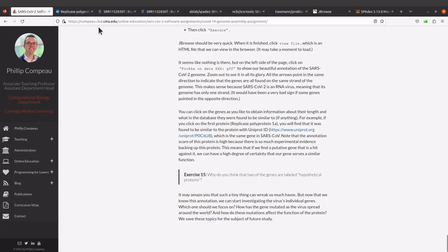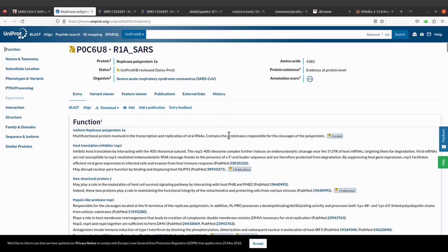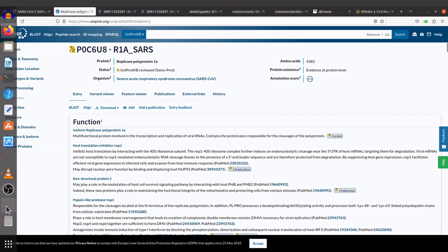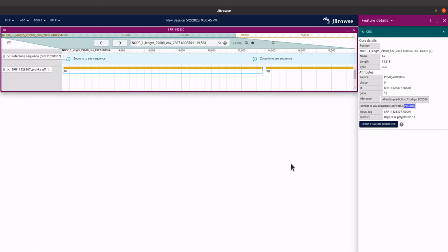Once you have that information it makes things easier, because at the end of the day you are annotating and we also need to find out more about the proteins. Maybe you have some proteins you are interested in — once you have those statements coming up, it's important you look them up. That is what we have just done here.